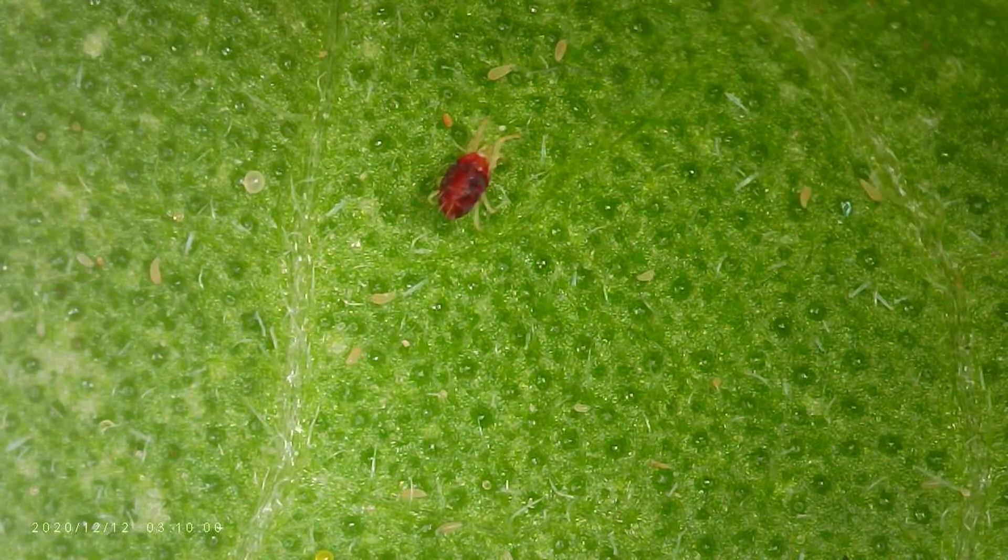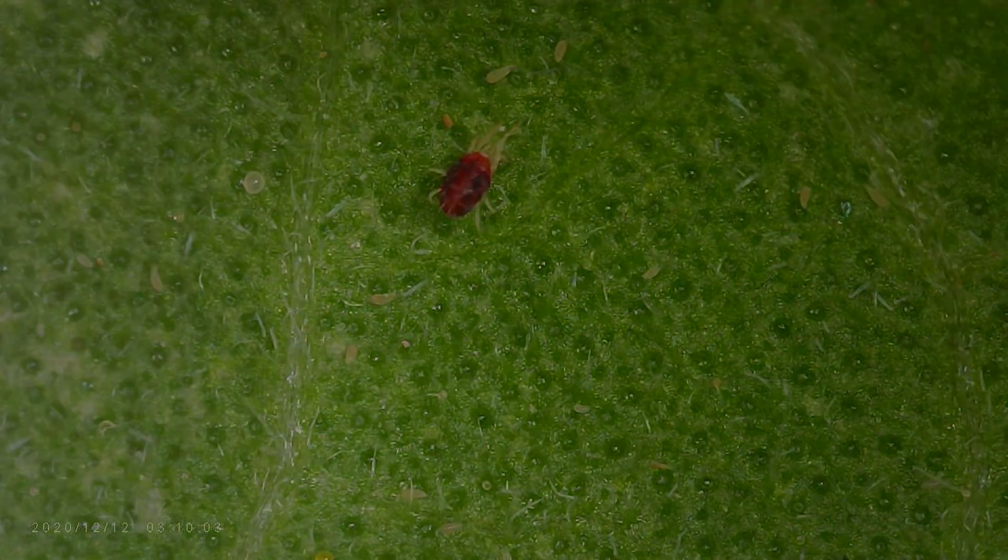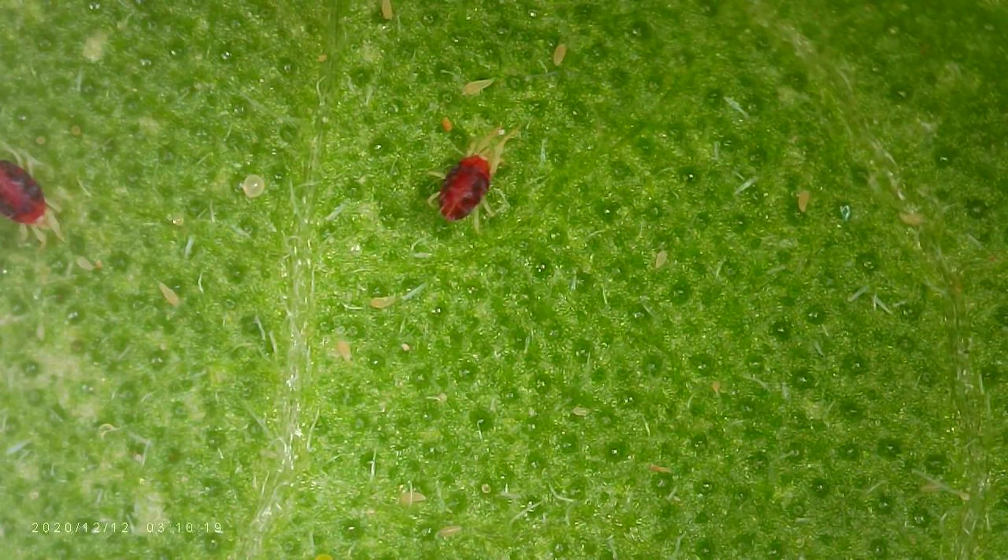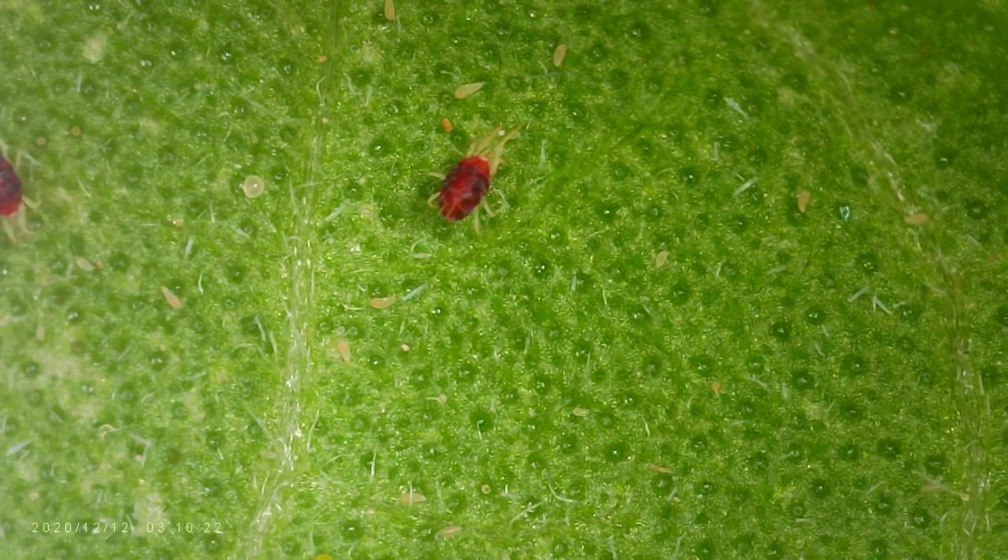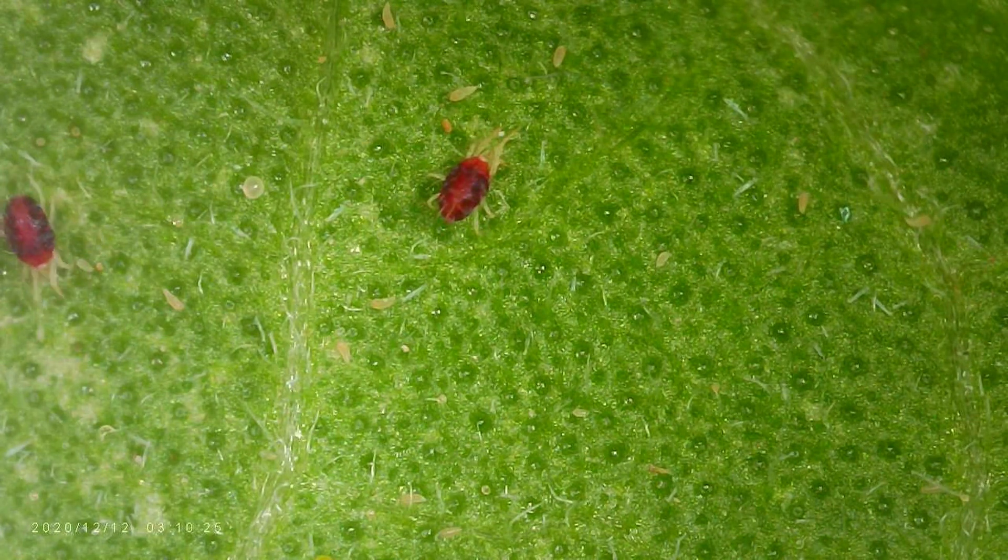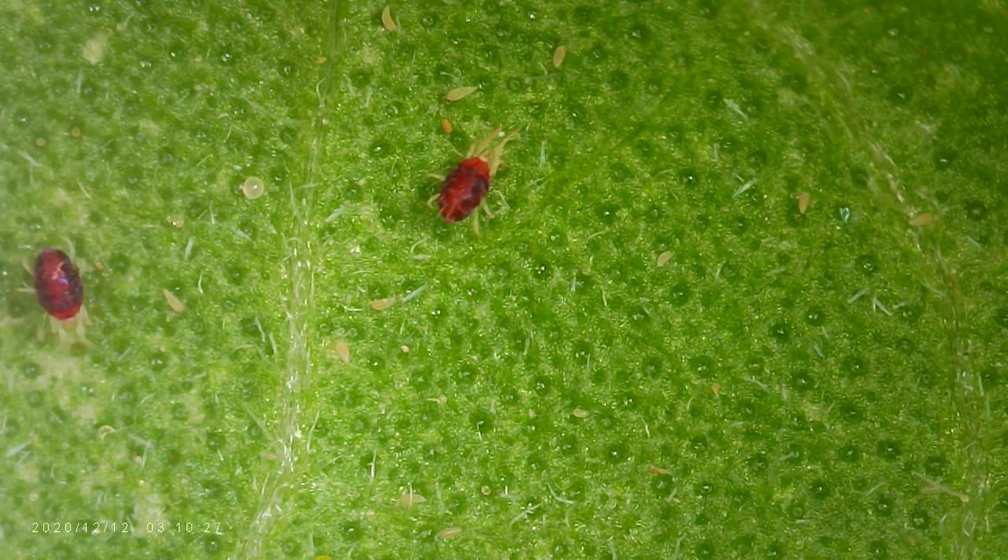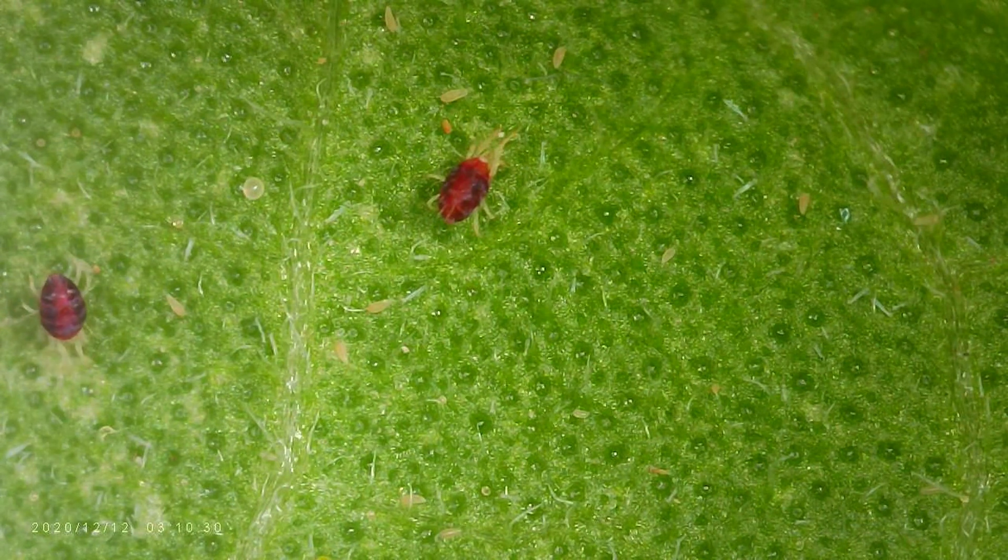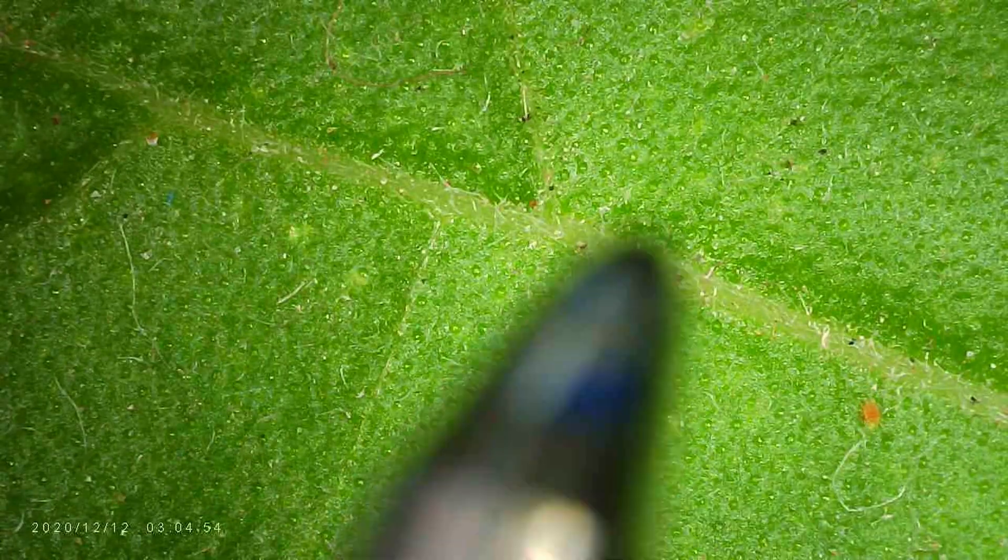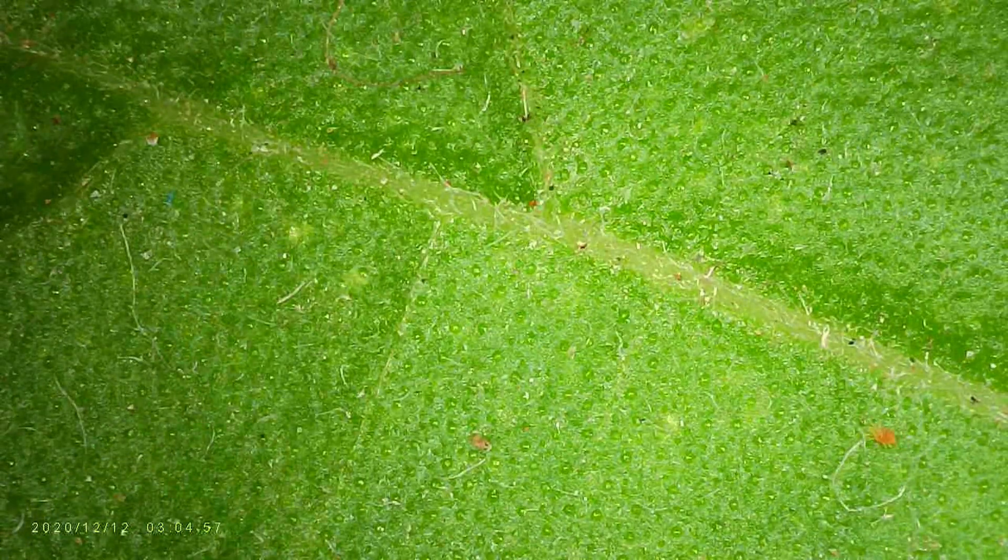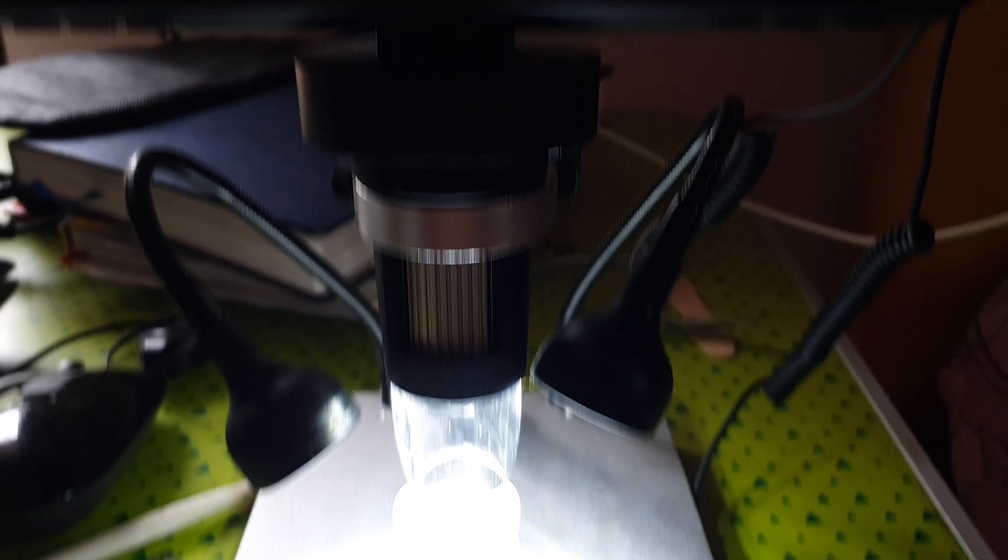Look how clear that bug looks on this. The beauty of this microscope is it lets you record all the stuff in full HD and it's really useful for someone who's actually working on a small science project and definitely going to be useful for someone who's doing something with a motherboard or some electronic components. Those are some of the other bugs which I saw and that's the tip of the pen and that's so much bigger as compared to whatever you're seeing on the leaf.